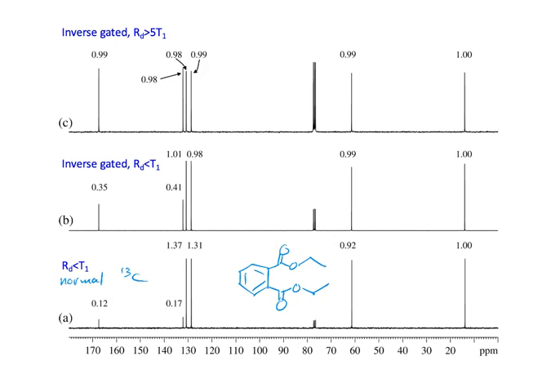Okay? And so what we see here is that the quaternary carbons here and here, so we have one for the ester. So this would be the ester, right? And this one that just says 0.17, I guess those are intensities or something like that, would be the two quaternary carbons here, because of course this molecule has symmetry down the middle, right?